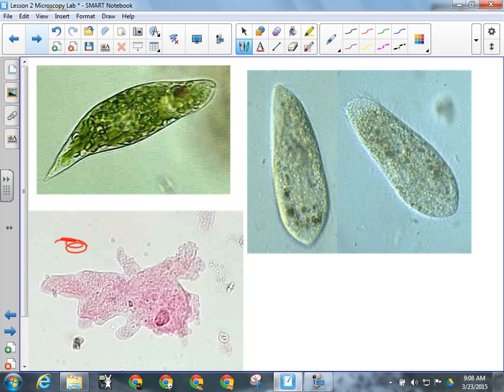Okay, the Euglena is actually a mobile photosynthetic organism. Okay, it's the same shape as the paramecium, but instead of having cilia, it has a flagellum. You know that tail-like thing I said is hardly on any cells? Yeah, it's got one of those right off the end. You probably won't see it because it's really, really small, okay? But it's on there, and that's how it moves around.